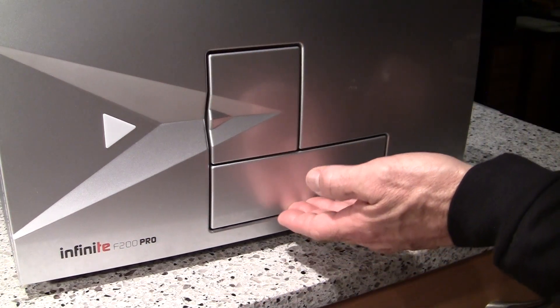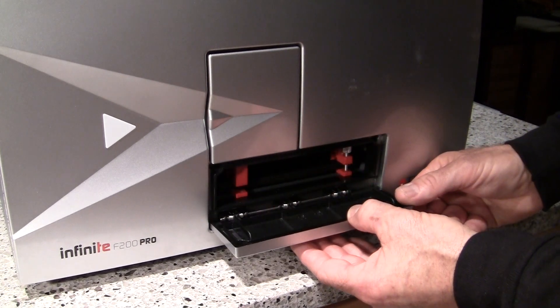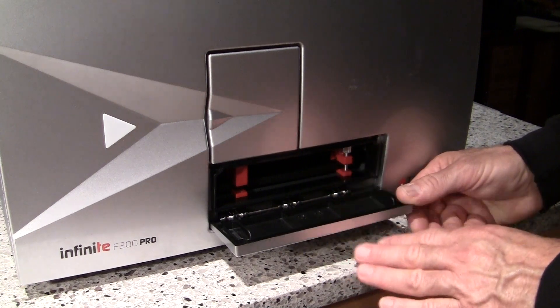Using your fingers, you can press on the base of the door here to start to hinge it open and then pull it the rest of the way open with your thumb, being careful not to place too much pressure downward on this door.